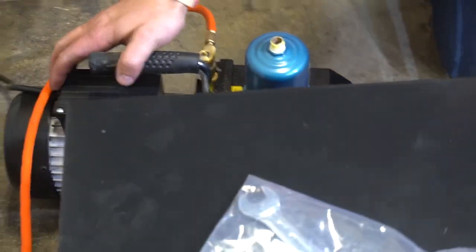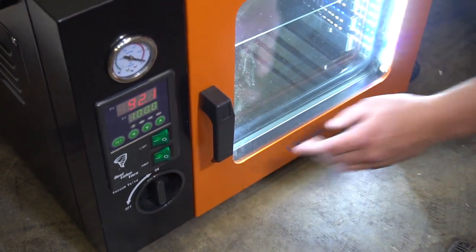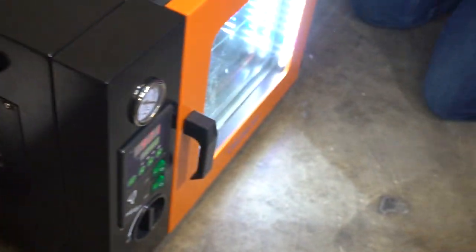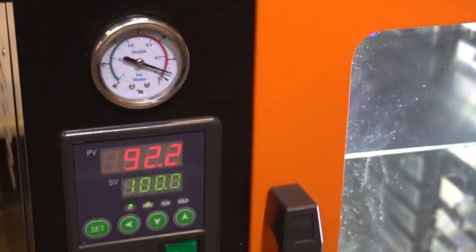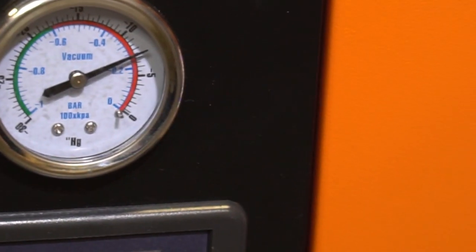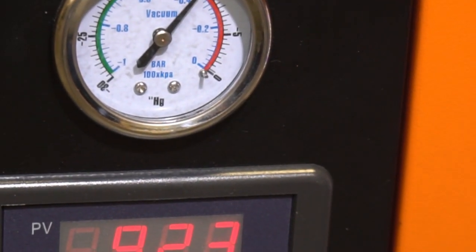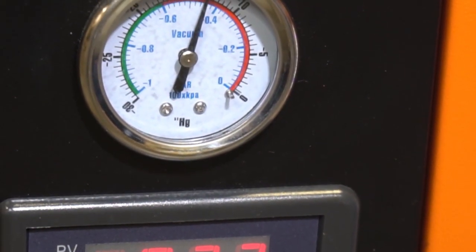Now we're going to turn this on. Make sure that your valve is open down here — the vacuum pump valve is on. Also make sure on the side that your port is closed. Turn on your vacuum pump and you'll see the level of vacuum on the gauge. You usually want to run your material at the lowest possible vacuum level you can get, so I'm going to let this go for just a few minutes. I'm also going to let it heat up and then we'll be ready to start purging our material.